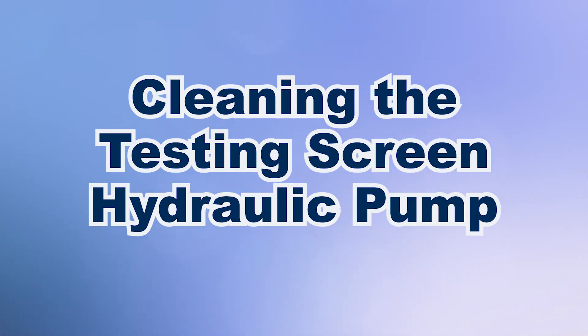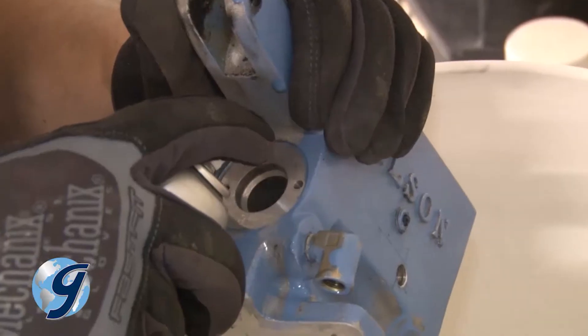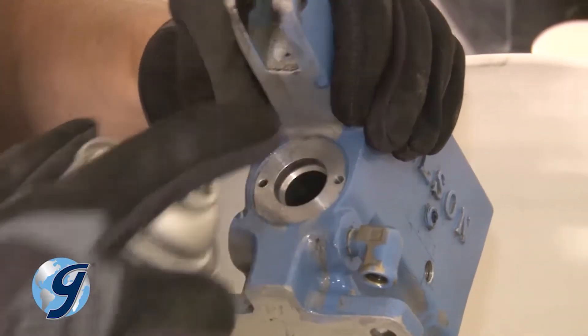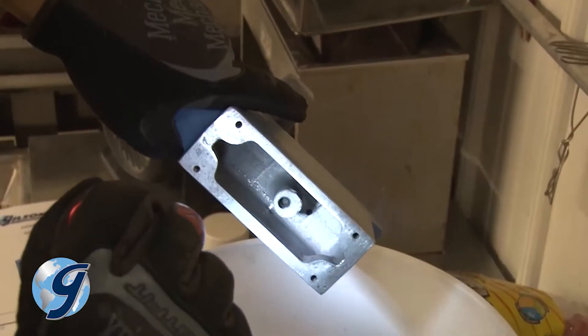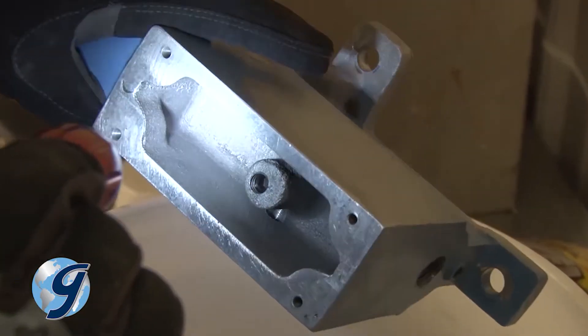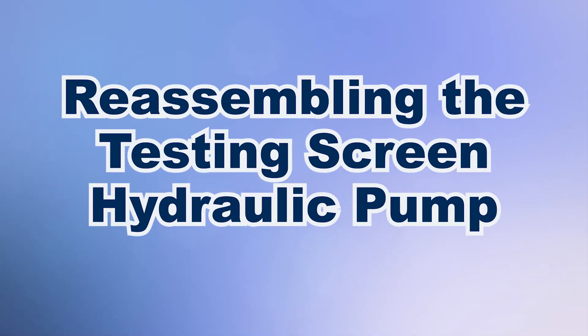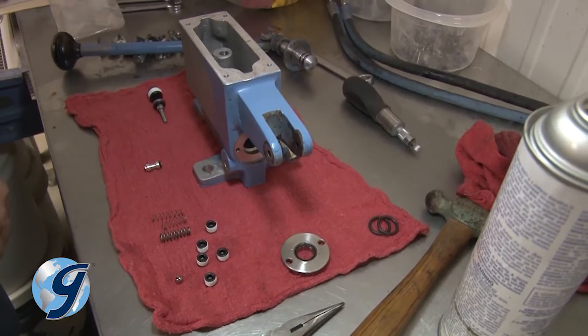Now that all appropriate components have been removed, clean all residue buildup from the pump. Next, inspect the entire pump to confirm that it is completely dry and free from dirt. Now you are ready to rebuild the pump using parts supplied from your Gilson Pump Repair Kit.